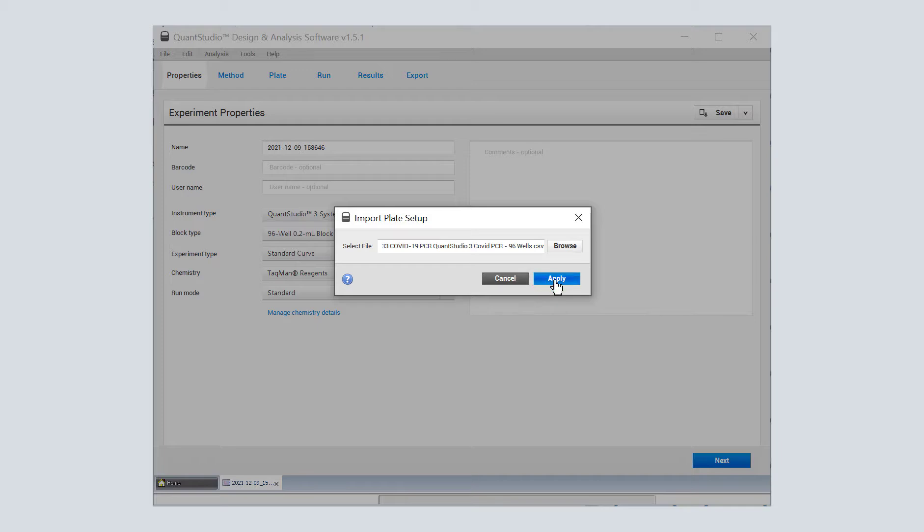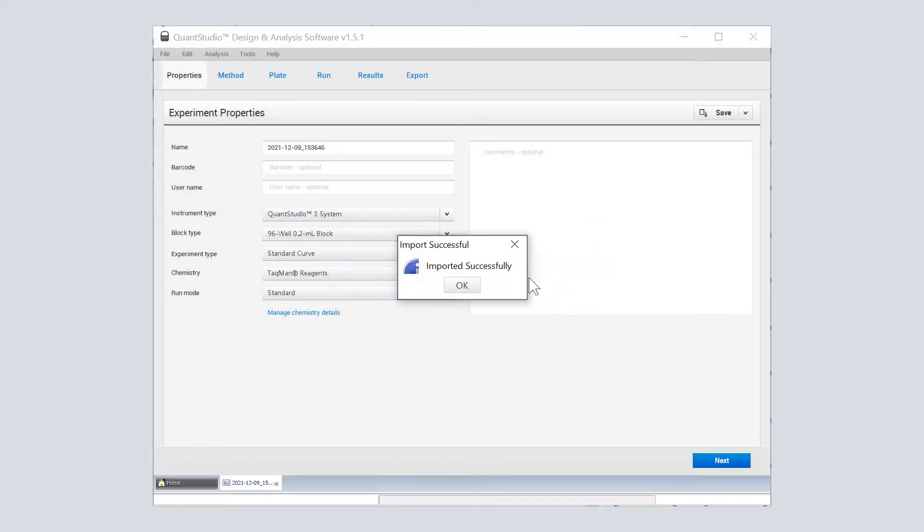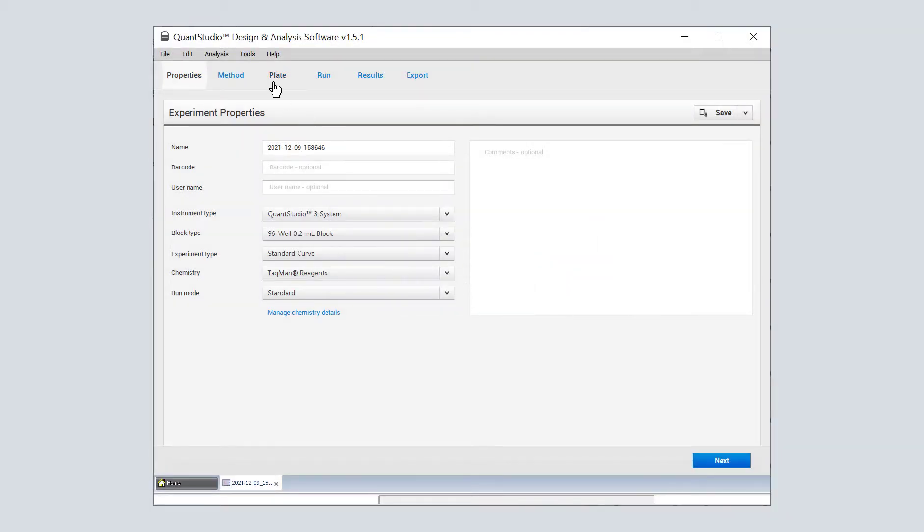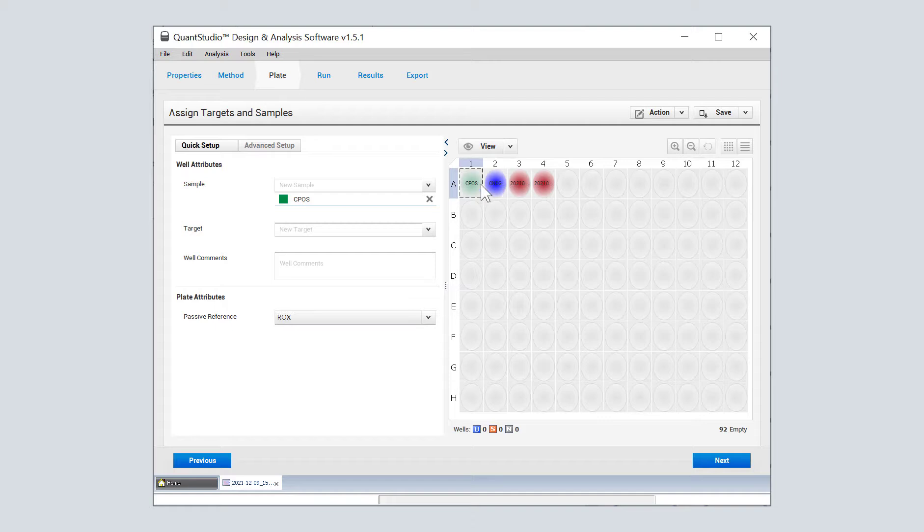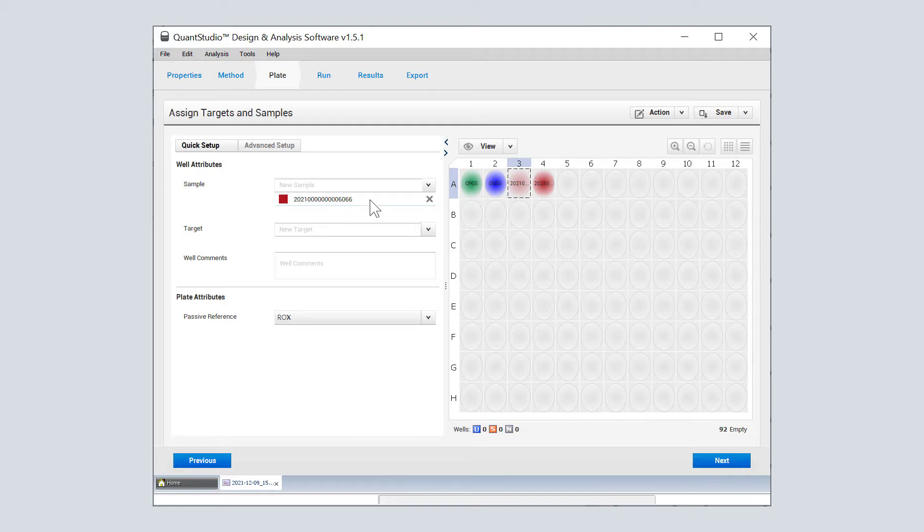You can see OpenAlice very conveniently date stamps those for us to make things a little bit easier. We're going to apply that plate setup. We're going to go over to the plate and see if it came through. Yep, that's the control positive, control negative, and here's the full sample number for each of the wells that we populated.